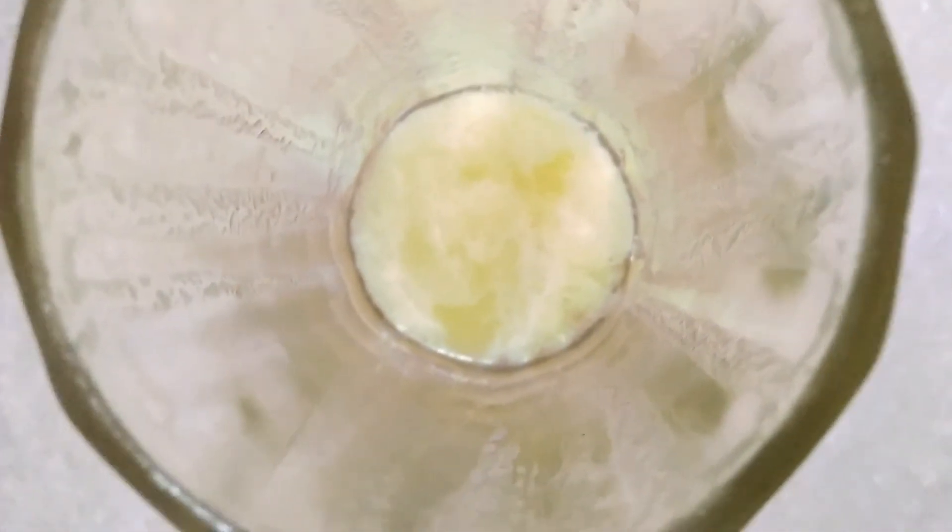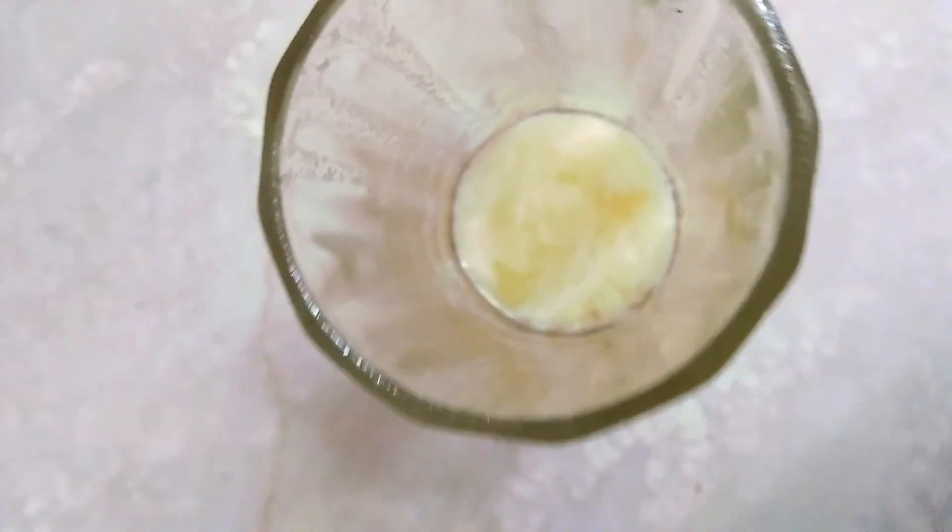Let's see what we have got now. This is the final product. This whitish layer you can see — this is the DNA.